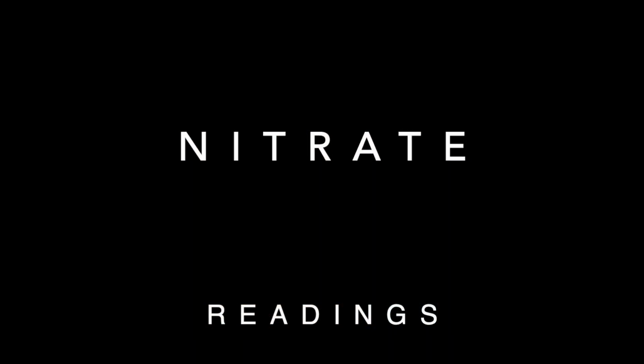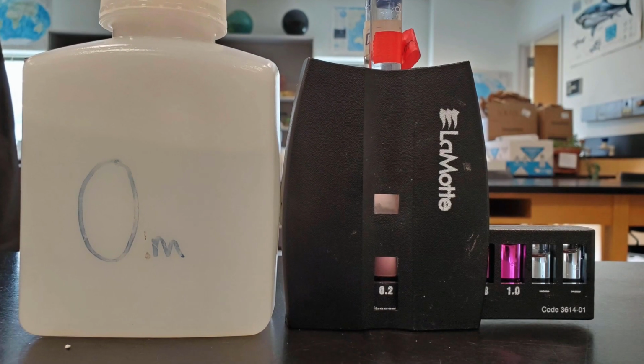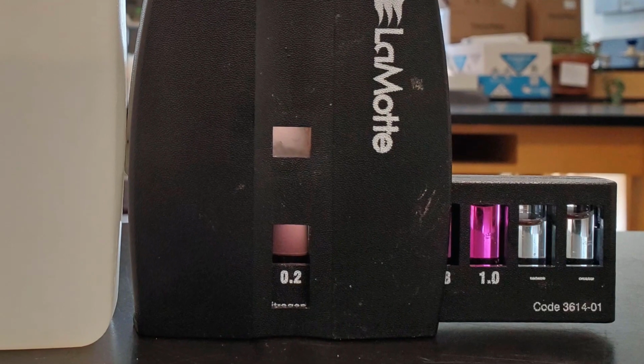The readings are done the same as they were for phosphate, except for this one. Please multiply all of your readings by 4.4 to get it into ppm. It is just the way this testing kit works. You don't need to do it for any others, but please multiply all numbers you read on this one by 4.4.